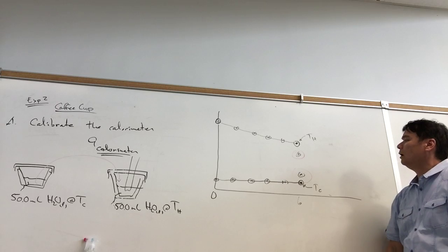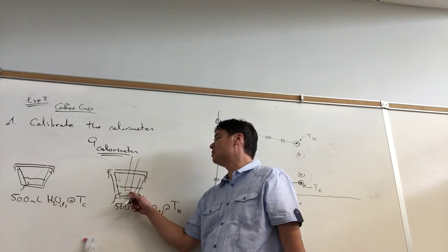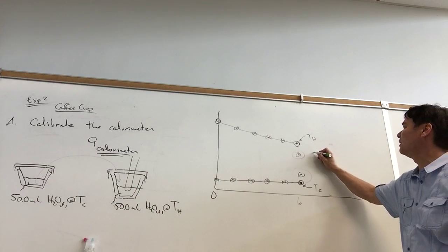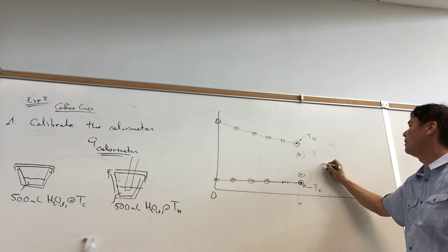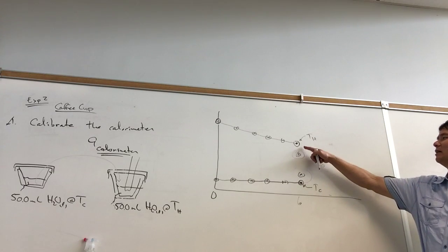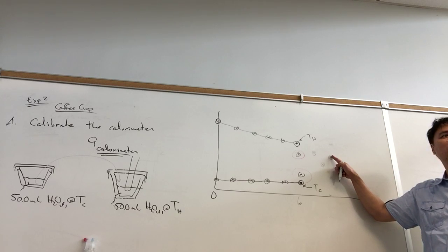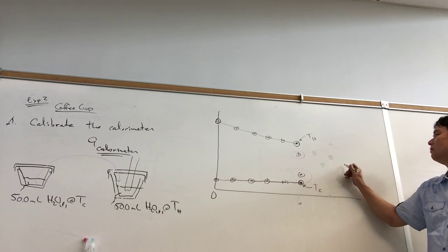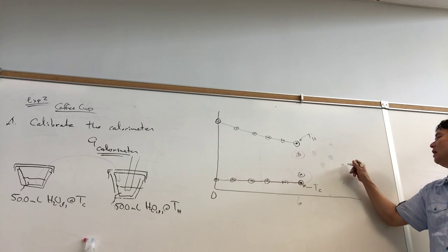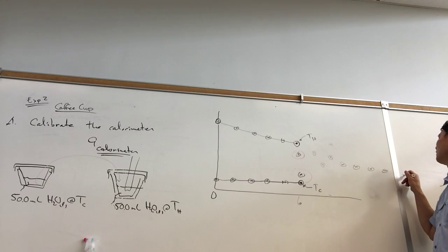But due to incomplete mixing, due to temperature gradients, what we might see here as we mix it, at minute 7, we might have a hot spot, we might have a cold spot, we might have a warm spot. And so would you expect it after mixing to cool down and then warm up? Does that make any sense? No, that's impossible. And so what we do is we ignore the initial points right after mixing and then wait for a steady cooling trend to be observed.